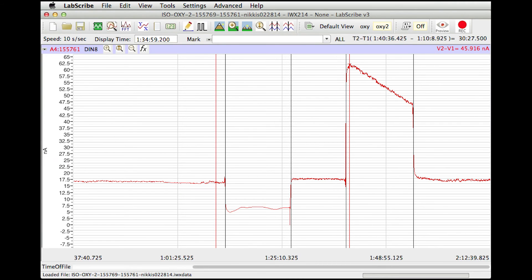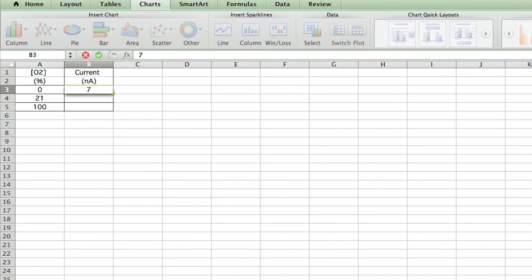The baseline recordings for the three samples with 21% dissolved oxygen should all be the same. Here is where the sensor was in the zero percent solution, and here it is in the 100% solution. Determine the current at these three levels and enter those values into an Excel spreadsheet.